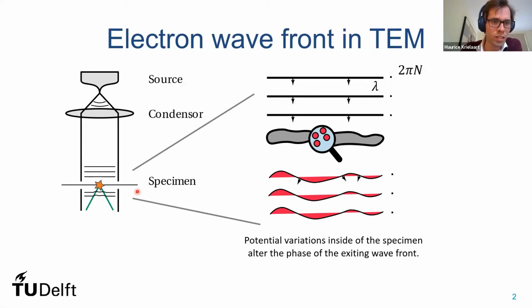How that works is basically, if we start from the top, we have an electron source, typically a very sharp pointed needle, from which we can extract electrons. As you extract them from the tip, they start to spread out over space, you may say due to the uncertainty principle. But anyhow, you can manipulate those electrons just as you would in optics with light.